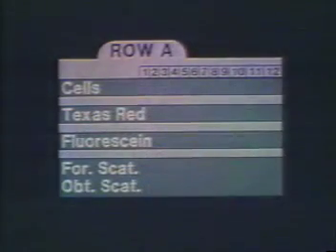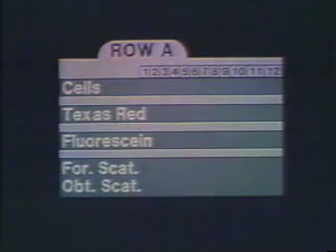Each row card is essentially a 12-column table with one column for each sample. The secretary has tailored these cards especially to Tom's experiment. The left-hand column of each table is divided into a series of subheadings, one for cells and one for each of the FACS sensors that Tom indicated he would use for this experiment. As Tom enters each of his cells and reagents, the secretary automatically lists them under the appropriate subheading.